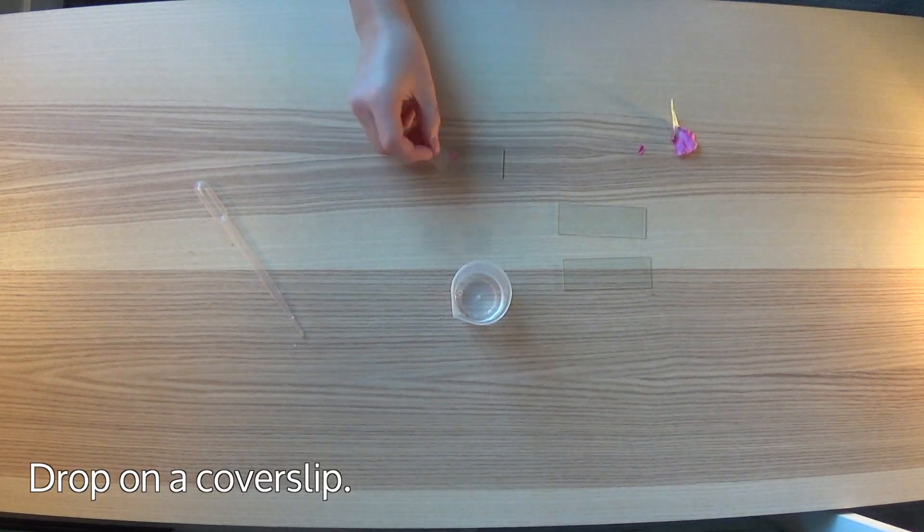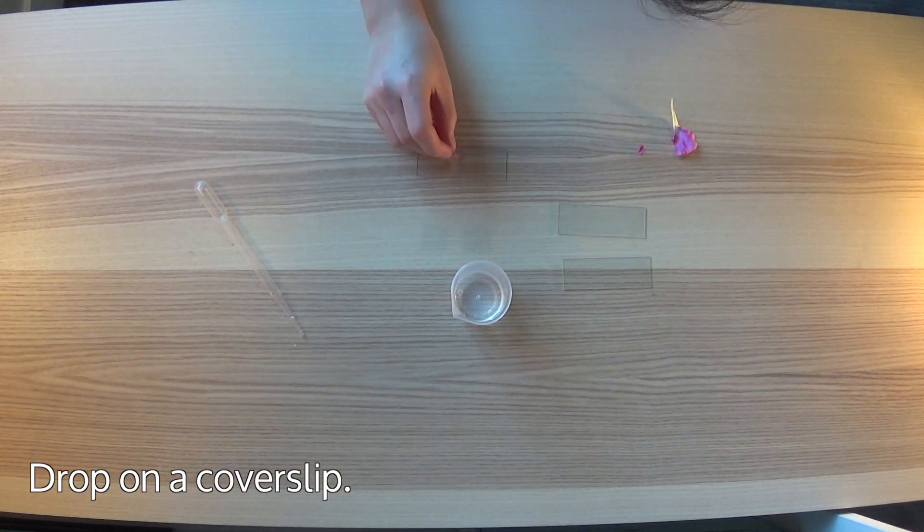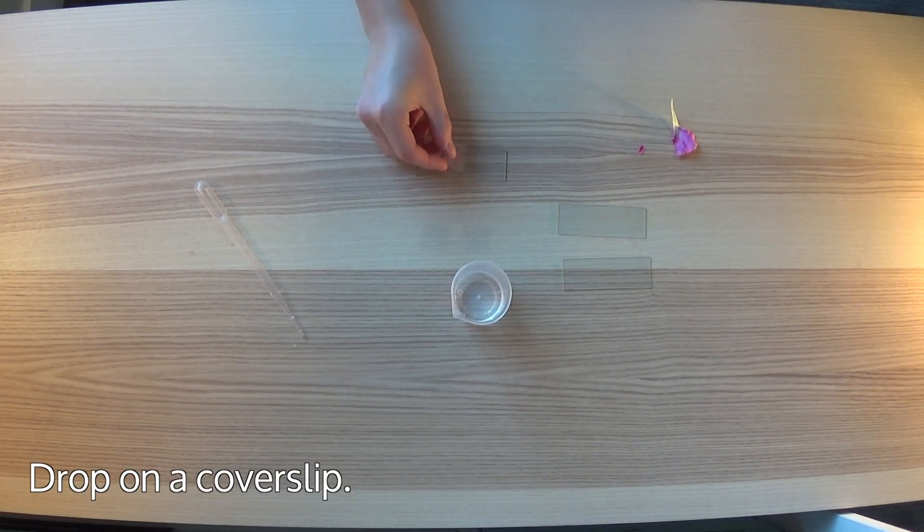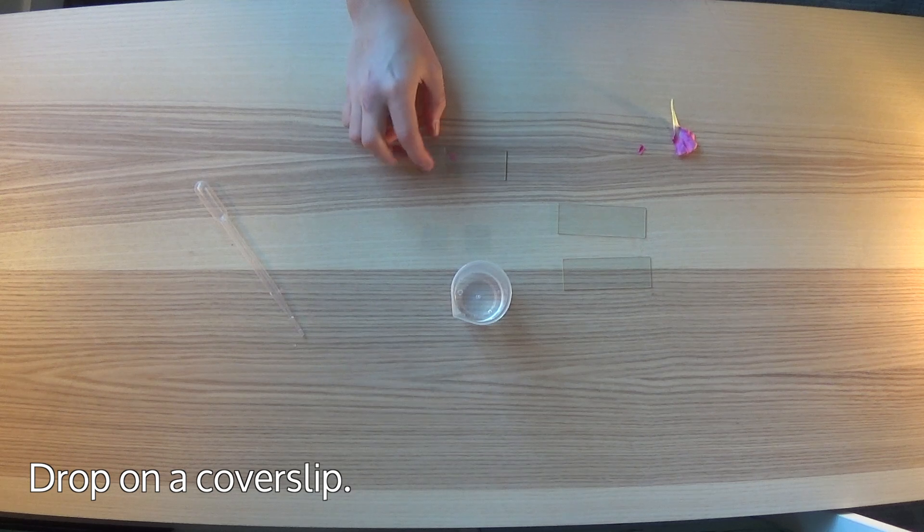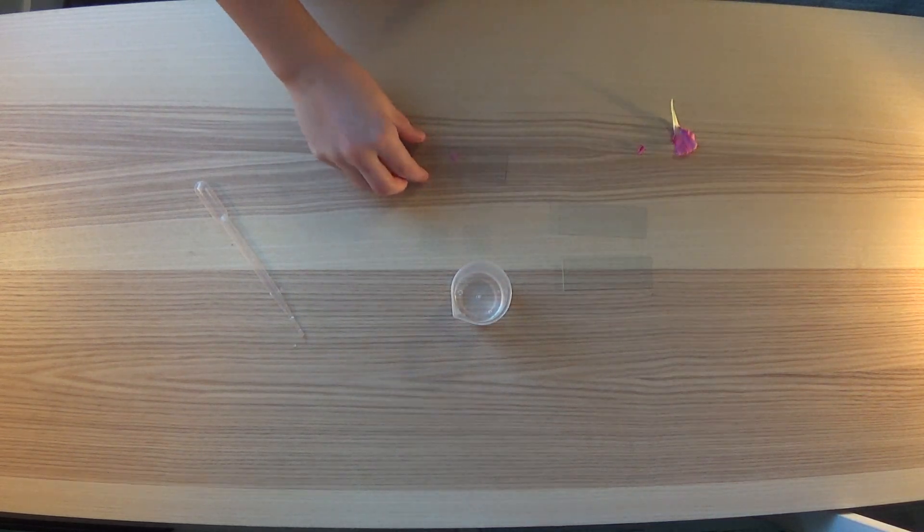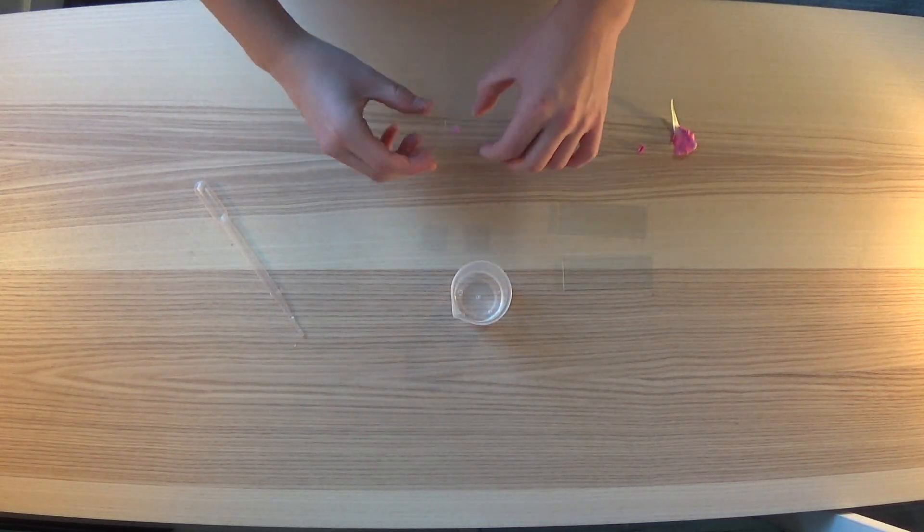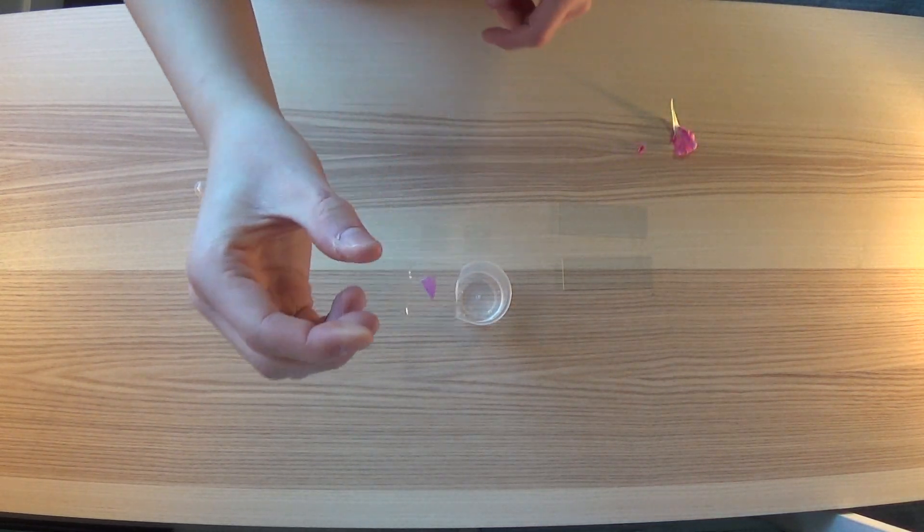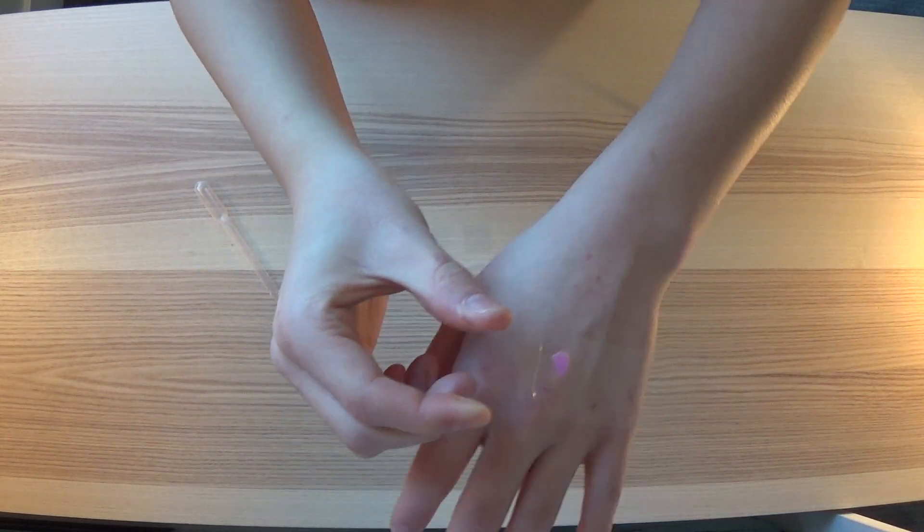Gently drop on the cover slip. And that's all there is to it.